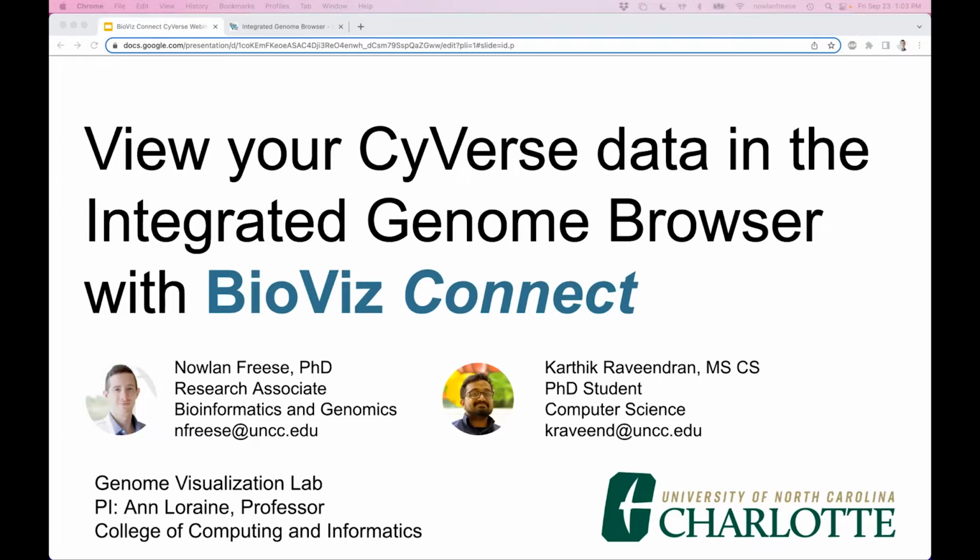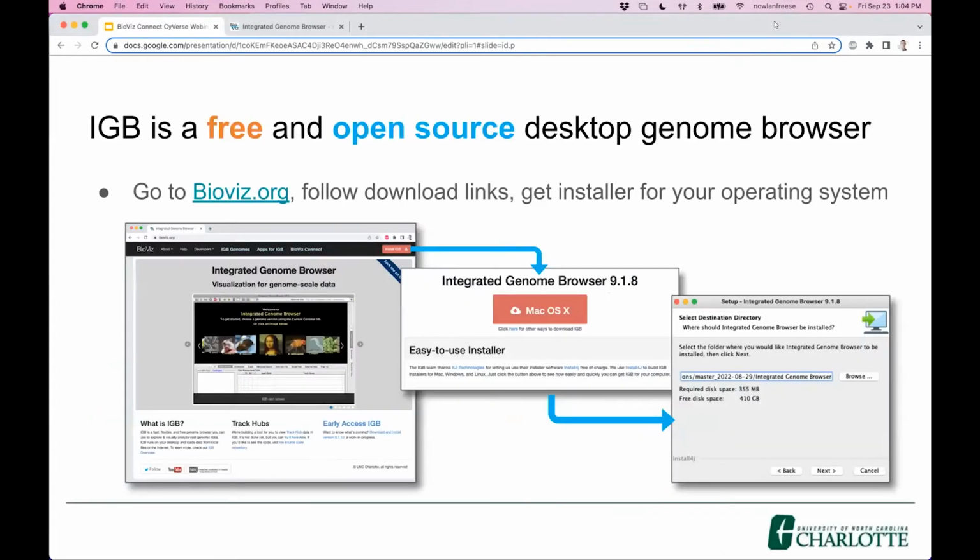Yeah, thank you, Tina, and thank you everyone for being here. So I'm Nowlan, and today I'll be telling you about our project, our web application, BioViz Connect, and how you can use it to view your CyVerse data within the Integrated Genome Browser.